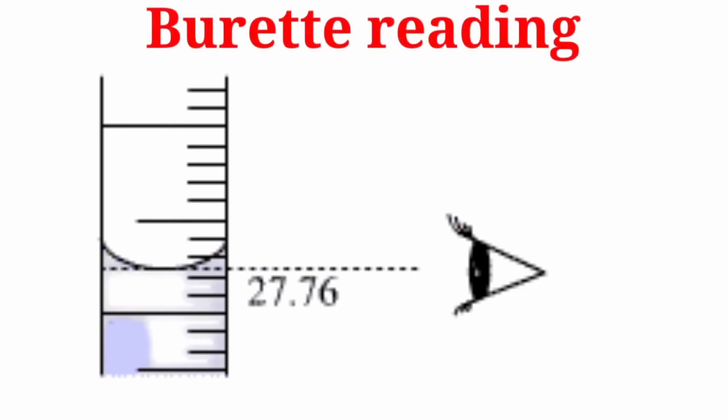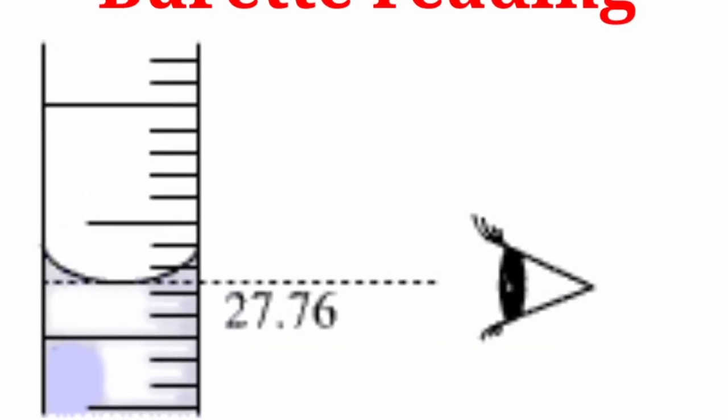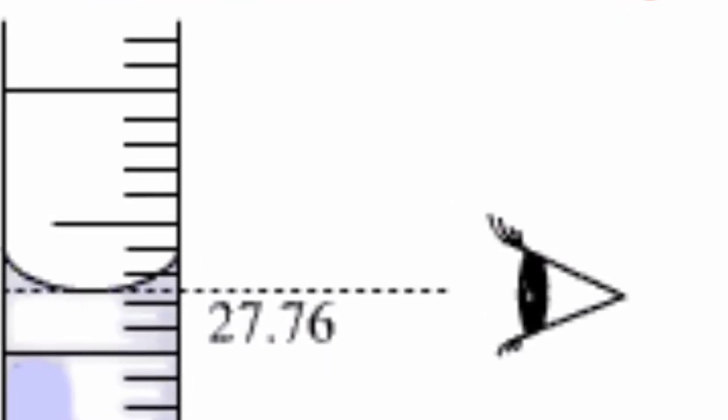In order to measure the amount of solution added in or drained out, the burette must be observed at eye level, straight to the bottom of the meniscus.